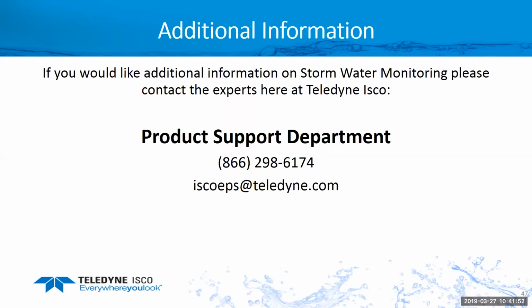There you go. If you contact one of us and just let them know you'd like to get the training documentation, I think that'd be the best way to get you trained on Flowlink. It's like 5 or 6 pages, and it walks you through. We have a database that goes with that, so it tells you which site to open. And going through that a few times gets you pretty familiar with that.